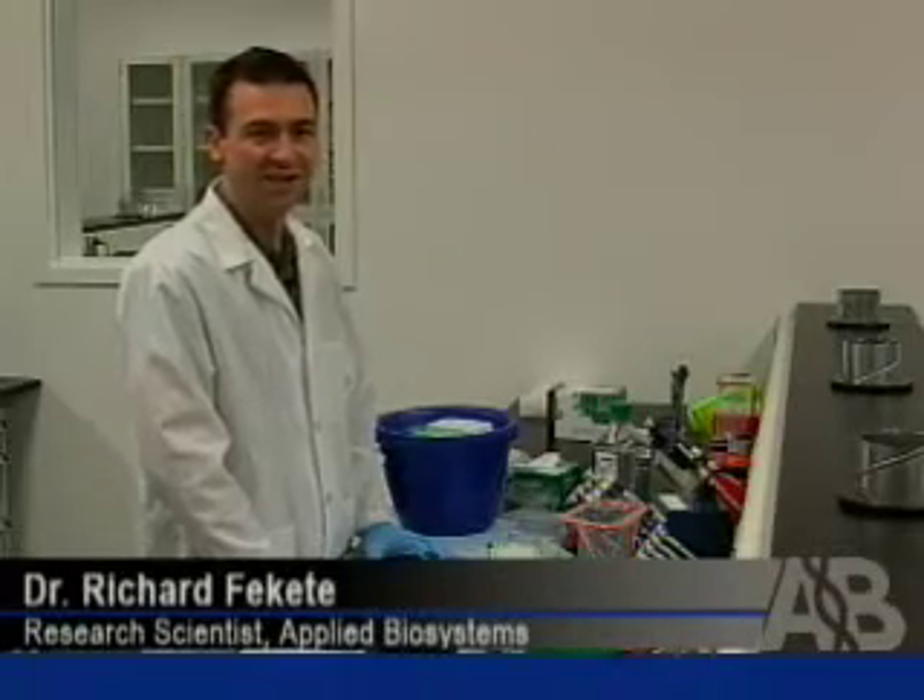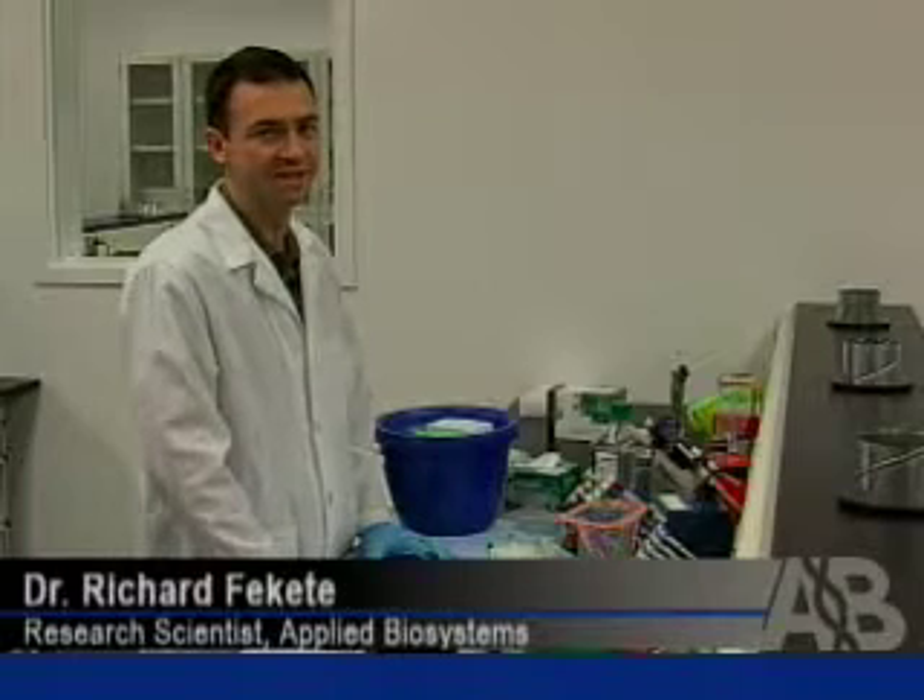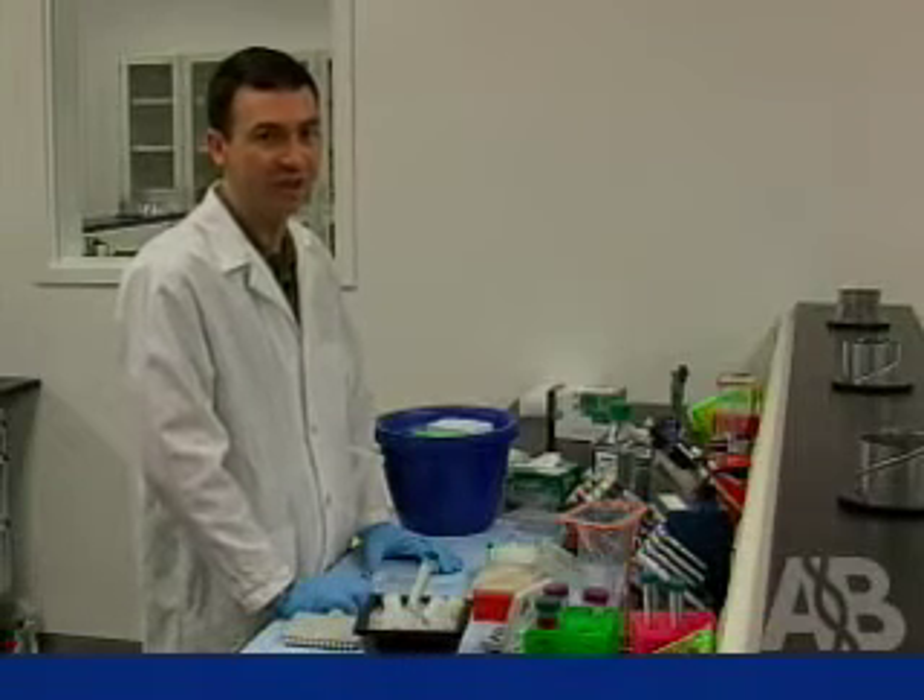I'm Dr. Richard Fouquet of Applied Biosystems, and I'm going to show you the benefits of the Cells-to-CT method versus traditional RNA purification.